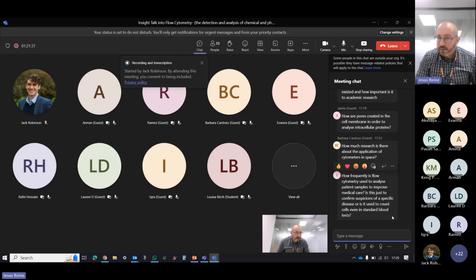So the thing is that defining what is normal, the standard values, is highly, highly important, because they give us the tool to understand what the expected values are, and if something is aberrant or has any clinical consideration, we can detect it very easily.